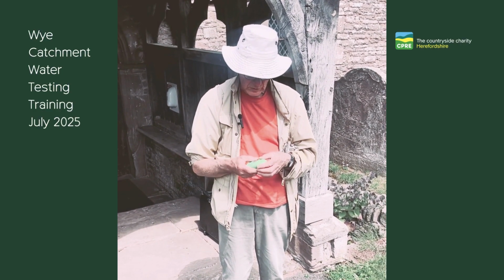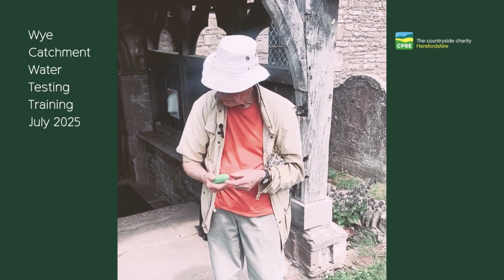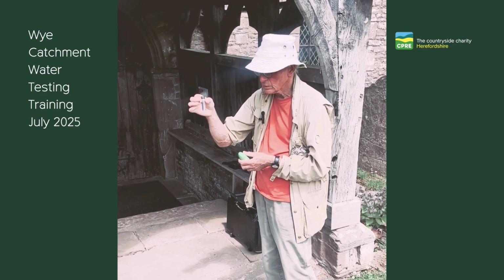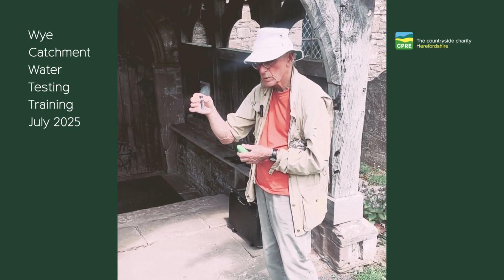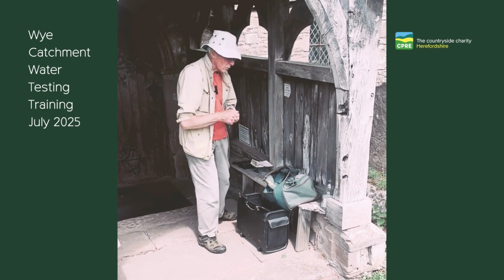in the Welsh tap water than you're likely to find in any of the streams that you'll be testing, which is why it's very important to wash out your cuvettes in stream water rather than tap water. Very unlikely that you'll ever see a natural sample that shade of blue. It'll be much paler than that. It's important to emphasize the washing out.